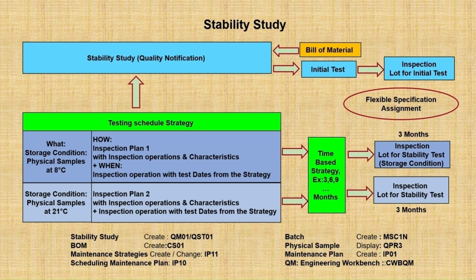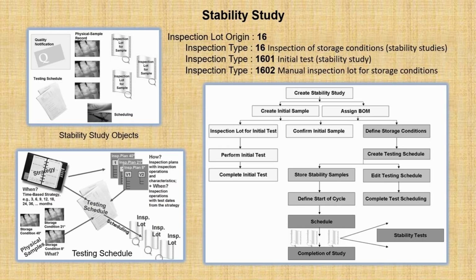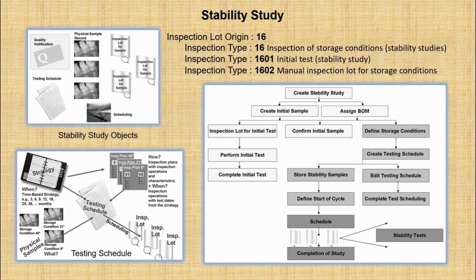Like how we specify it for the calibration inspection, similarly for the stability study there will be one total period and another is after how much interval I want the inspection to be done. Once my quality inspection has failed, because I have done the inspection on the material and my results were out of specification, it is no longer good. The last time when the product was okay, that was my SLED, the total life of that particular material.